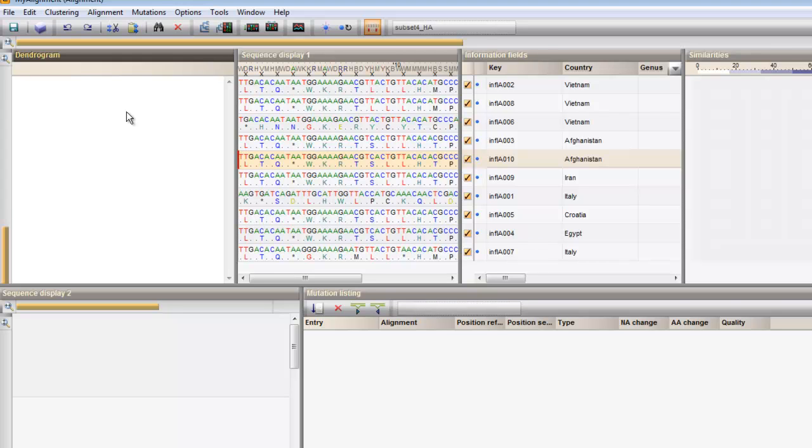By adjusting the translation settings, it is possible to show only the amino acid sequences.